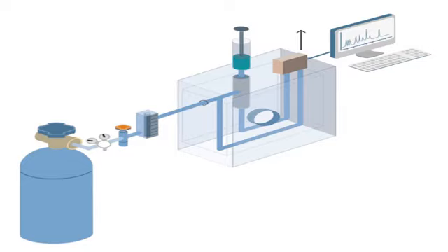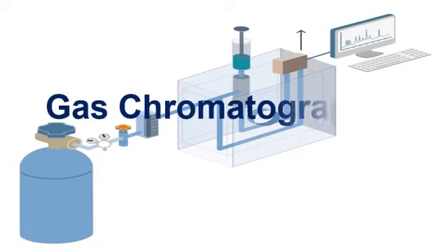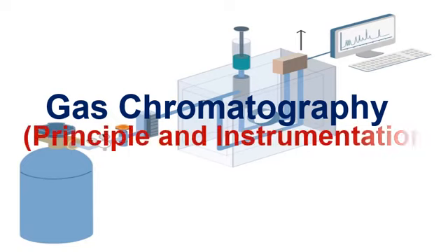In this video, we are going to cover a very important technique of analytical chemistry known as gas chromatography. We will discuss what gas chromatography is, what the principle of gas chromatography is, and how the instrument known as a gas chromatograph works, and how we can analyze a sample using gas chromatography.